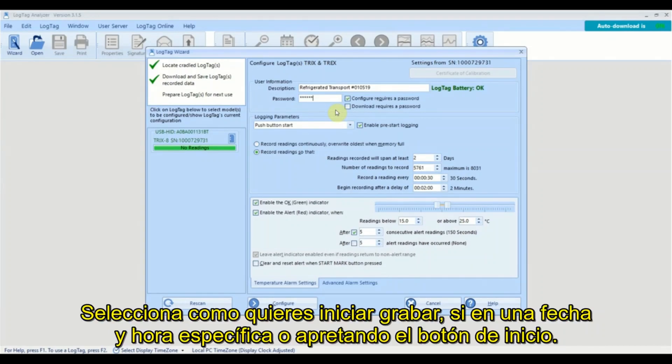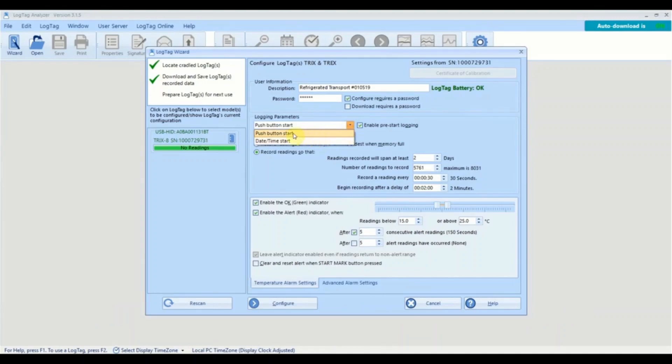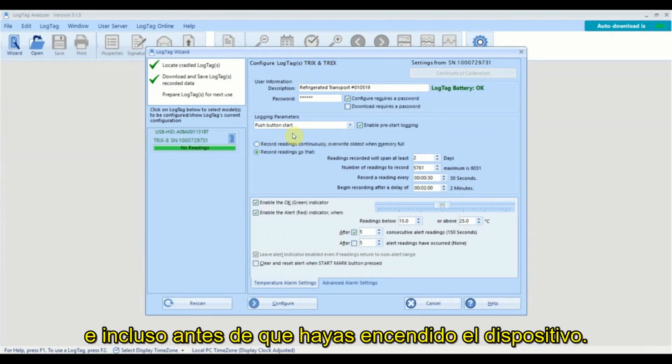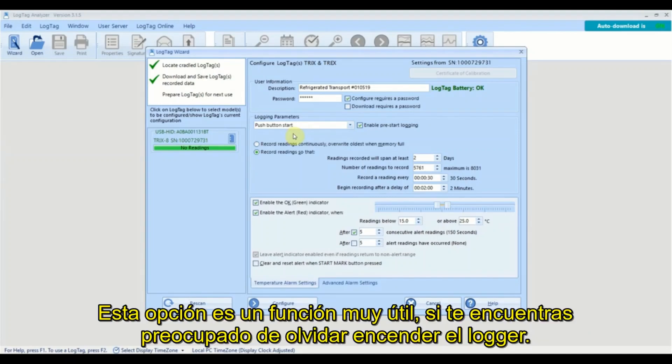Select how you wish to start recording at a specific date and time or by pushing the start button. If you enable pre-start logging, the logger will start taking readings as soon as it's configured and before you have actually started the logger. Pre-start logging is a useful feature if you are worried about forgetting to start the logger.